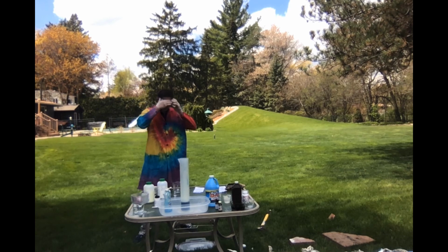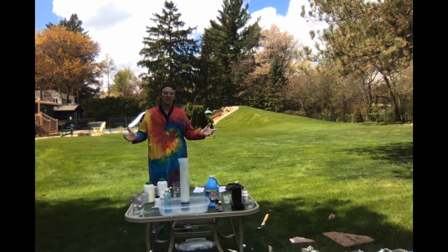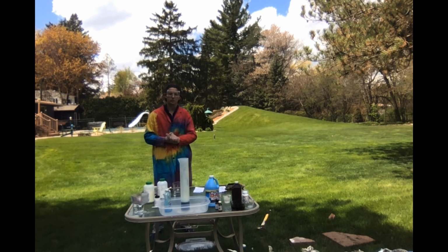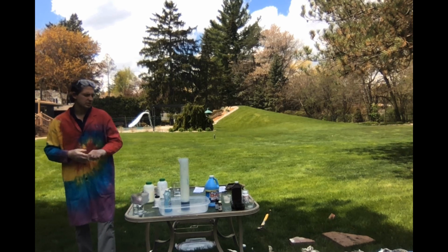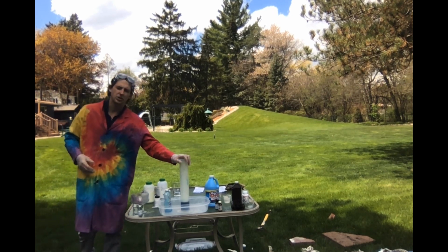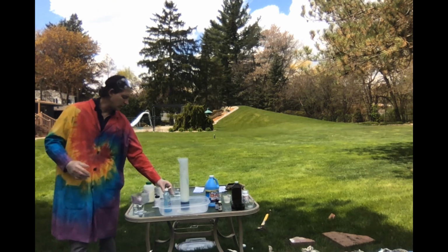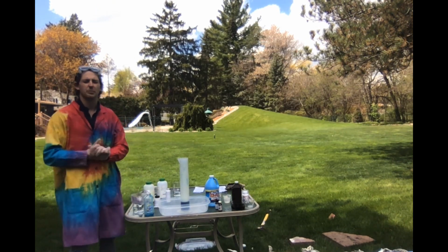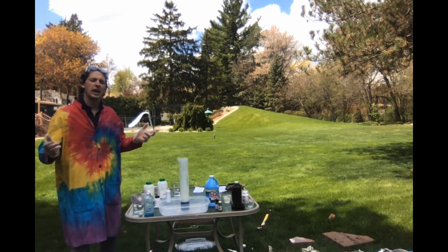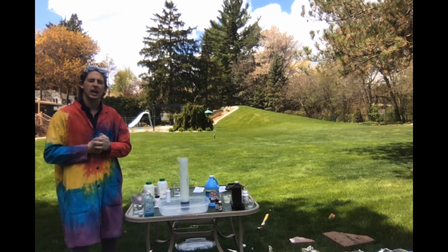Wow, I know there's a little different setting there, but it still occurred. All right, that is elephant toothpaste. Hopefully you guys were able to see some changes. All right, definitely expansion of the material, an explosion everywhere. You hopefully have seen that before. I'm sure you have, especially if you've been in my STEM class. And that's all we have here for physical and chemical changes, evidence, observations.